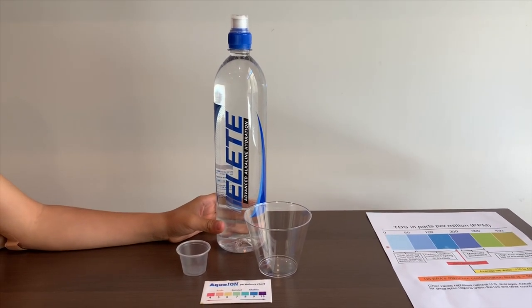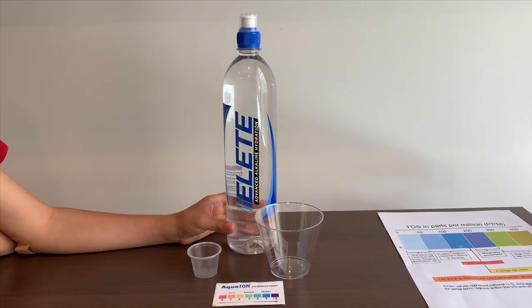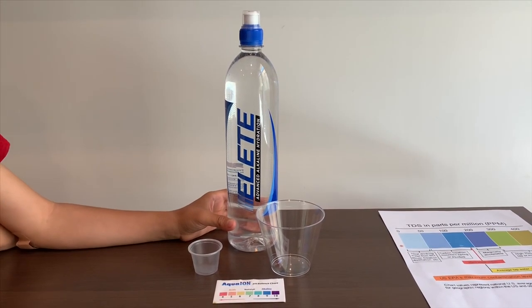This is only purified alkaline drinking water and costs $3, sourced from the USA. Let's test the pH and TDS levels.